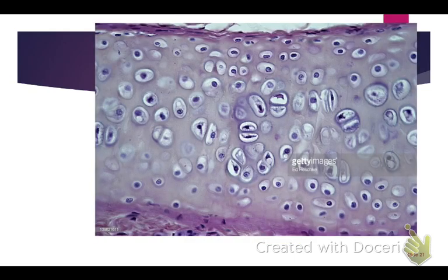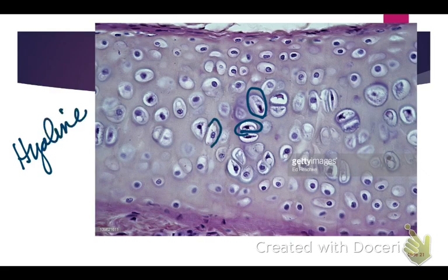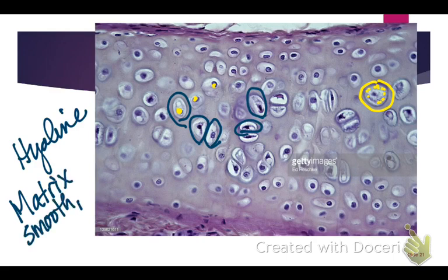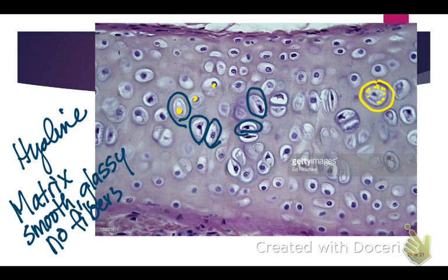My favorite image — can anyone identify this? It is hyaline cartilage. You can see the lacunae with cells inside them; switching to yellow, you can see individual nuclei inside the cells within each lacunae. Hyaline cartilage is distinguished by having a matrix that is smooth and glassy in appearance with no fibers — you don't see any lines running through it like you would in fibrous cartilage.